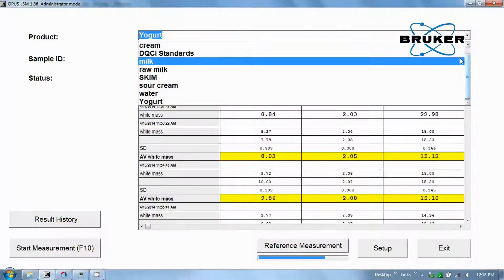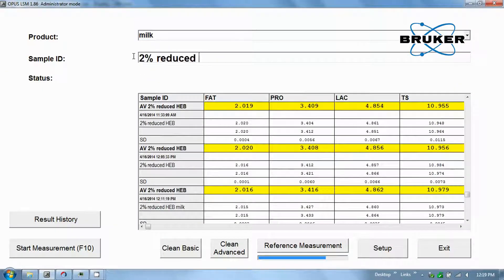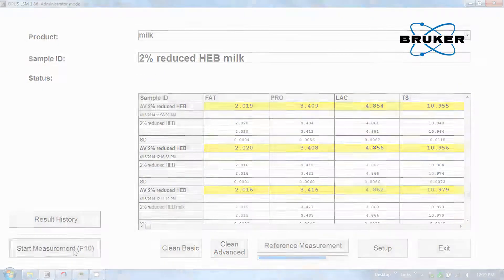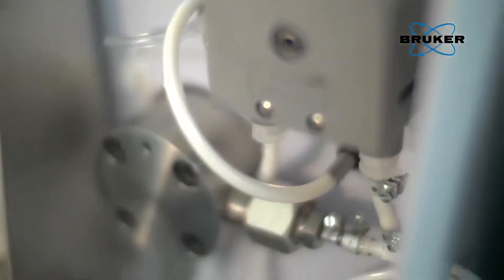Select the product, in this case milk with 2% butterfat, from the drop-down menu and start the measurement. The milk is pumped into the MPA through the homogenizer, and your results appear on screen.